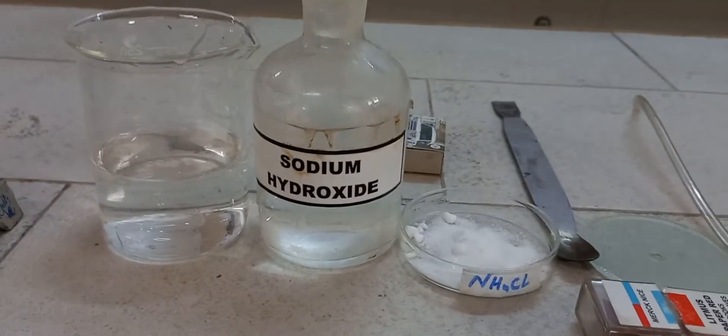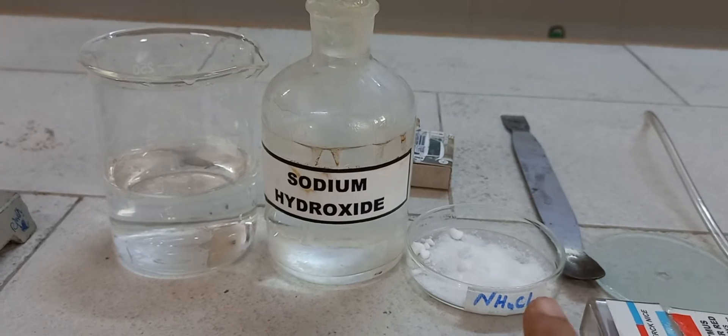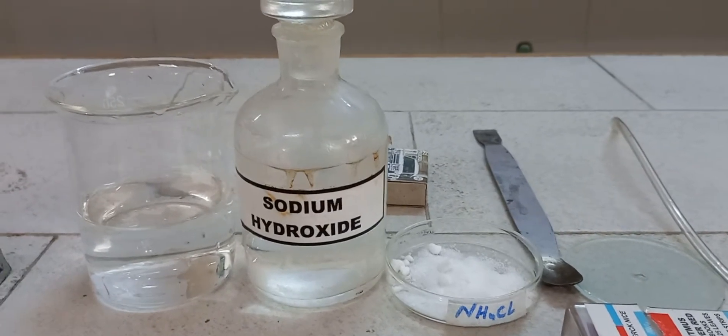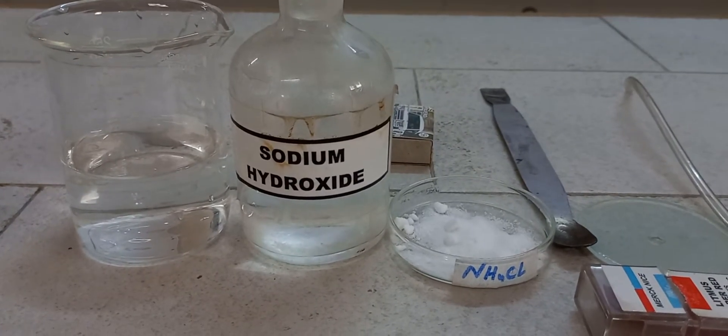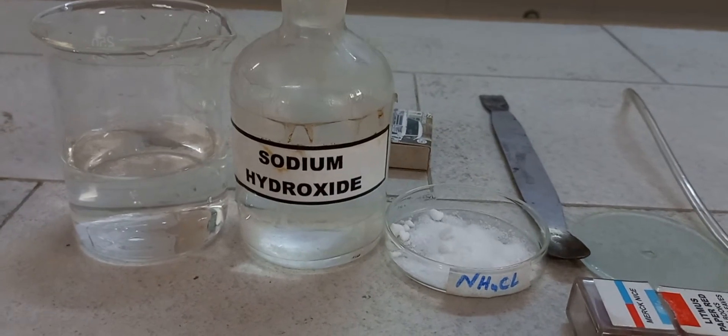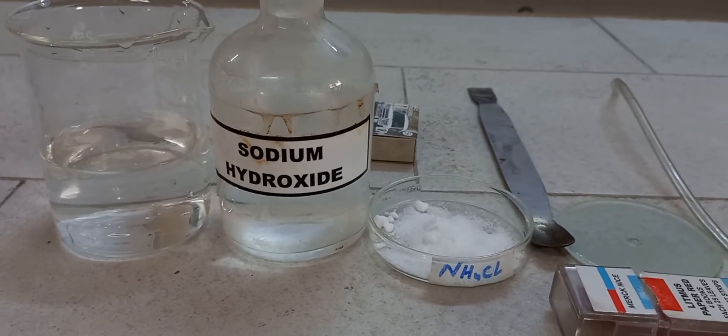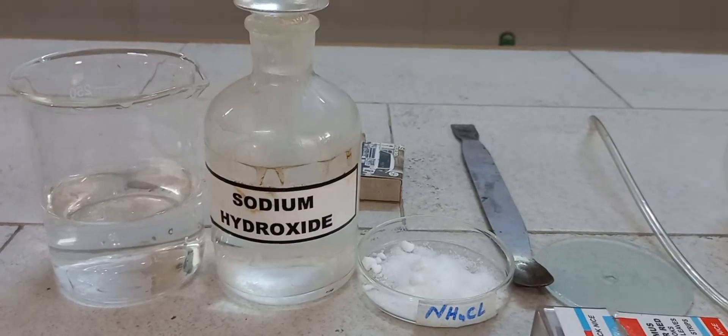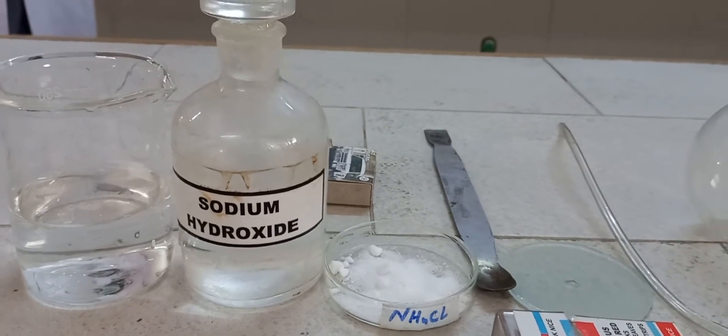For the preparation we have sodium hydroxide as a chemical. When we add sodium hydroxide to any ammonium salt, here we have ammonium chloride, they liberate ammonia gas. So the alkali we have is sodium hydroxide and the ammonium salt we are taking is ammonium chloride. When we mix them together and slightly warm them, we will be getting the ammonia gas.